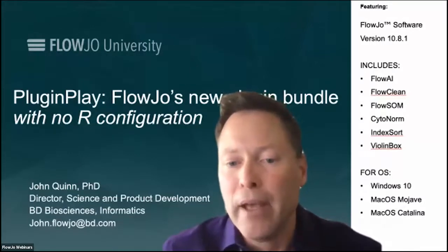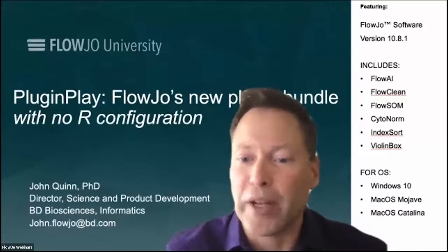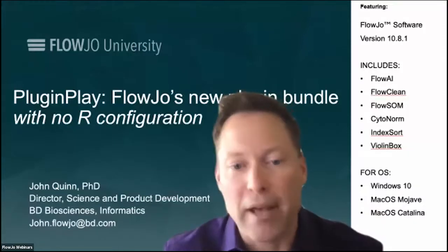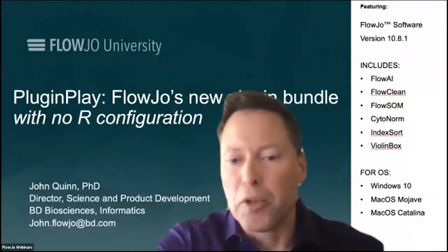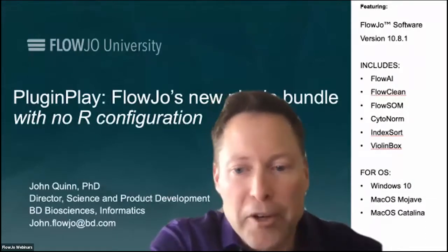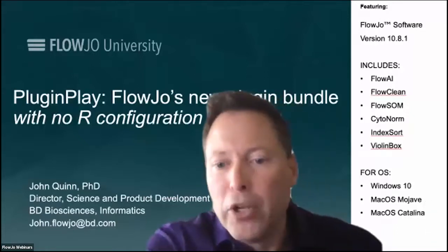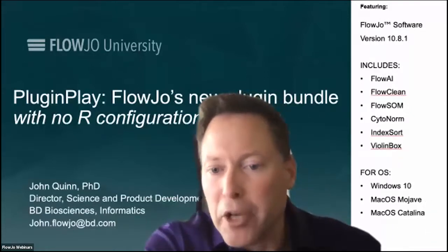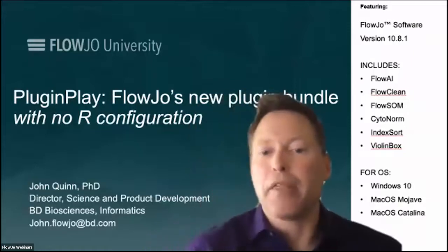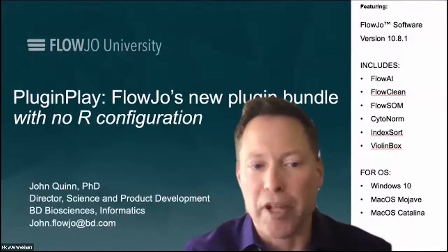get and use. The other important part is, for the moment, these are just for specific operating systems. So just for Windows 10, just for Mac Mojave and Mac Catalina. The plan is to extend them in the future so that they work on the more modern Mac OSs and for Windows 11 and so forth. But since we have them up and running and ready to go for those operating systems, which I think are what most folks are running on right now, it's time to make them available.